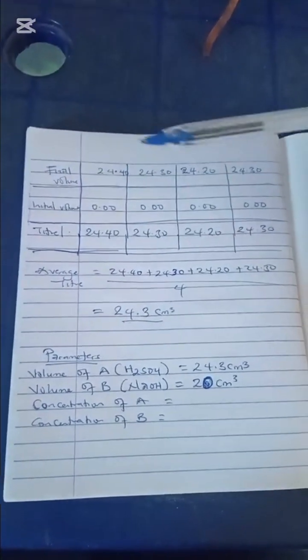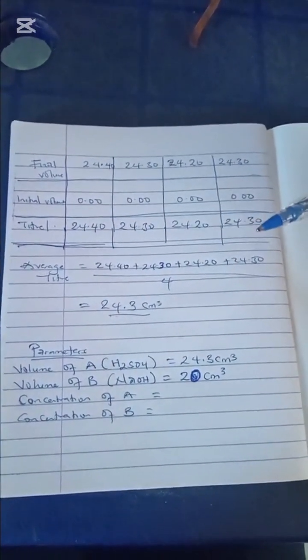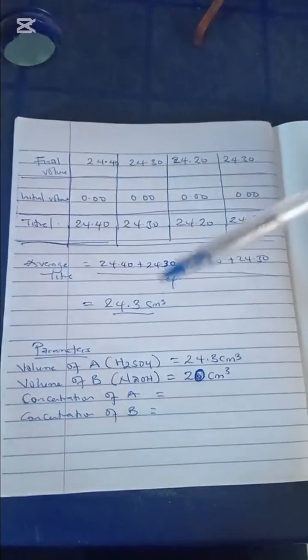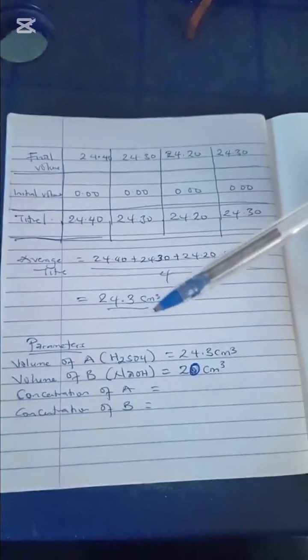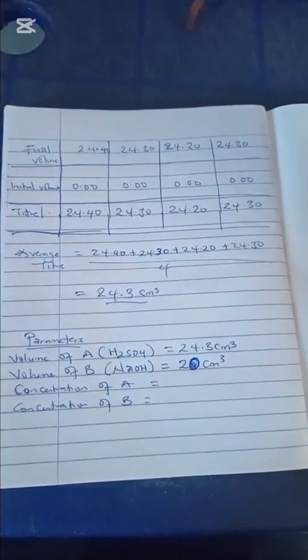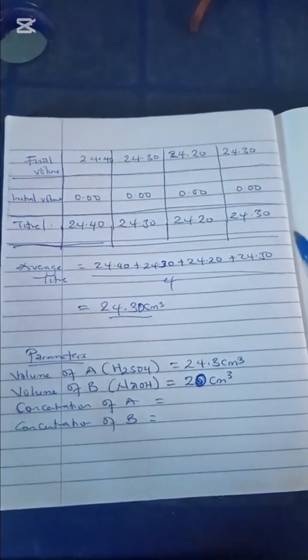So we'll take the average titer. The average titer means you add all the final results you obtained where the color change occurred, and you divide by 4 because you did it 4 times. So divided by 4, the average volume of acid used is 24.30. I think I should add 0 to it. 24.30.